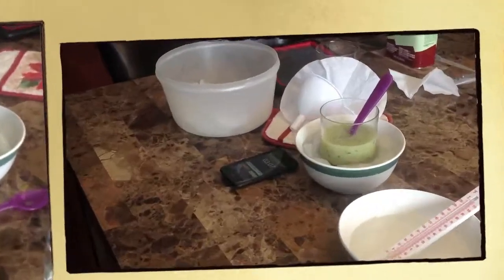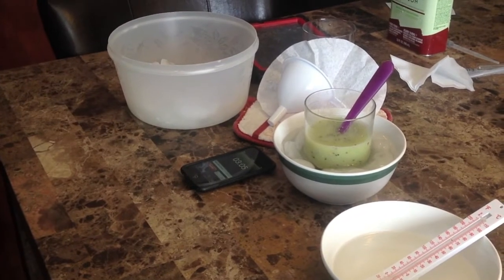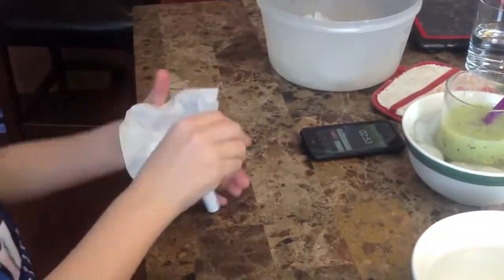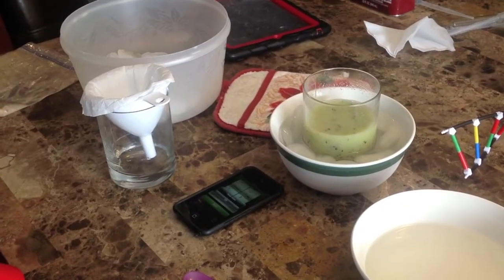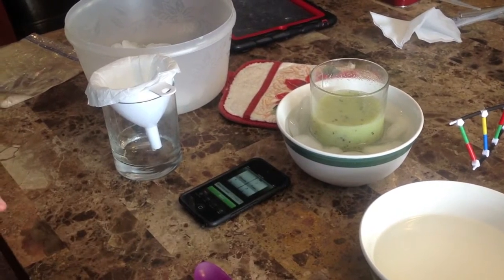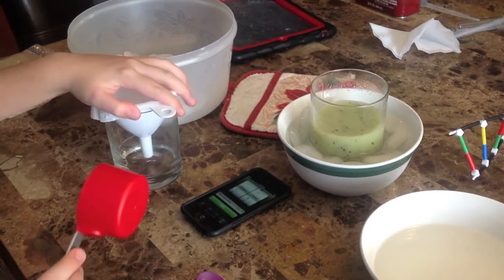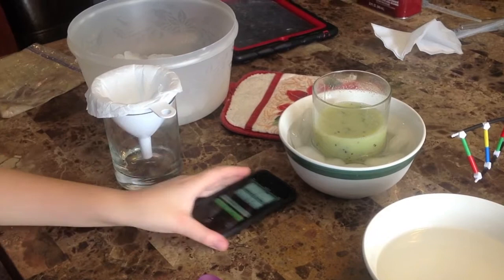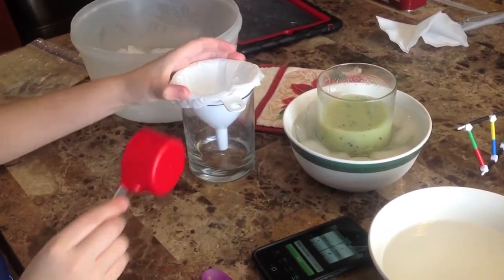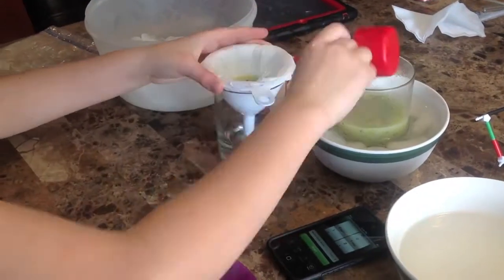Wait for your mixture to chill. You're going to prepare your filter and your filter paper. Now that you're ready, transfer your mixture into the filter and filter it.